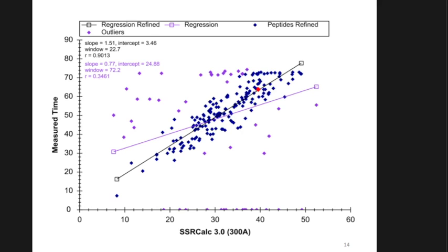And you should really never see something like that. It should be a gradual correlation. Yep. So Sue was just mentioning, for people listening in at home, at the 70-minute mark, there's a horizontal line of peptides, and that might indicate something's happening at the end of my gradient, that Skyline's thinking, oh, that's where all of my peaks are, when we can tell by looking at this retention time pane in the regression view, that doesn't look like it's right at all.